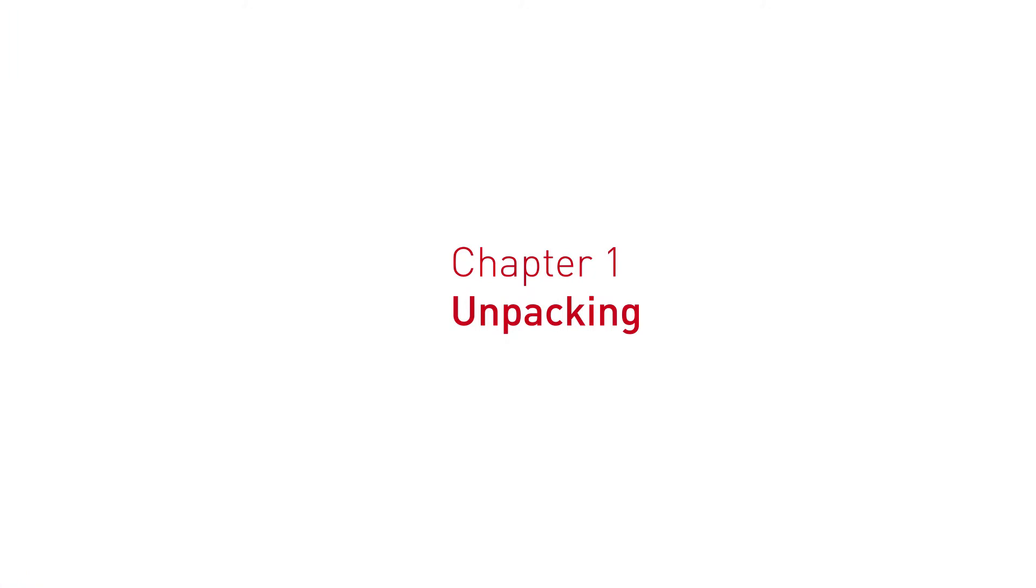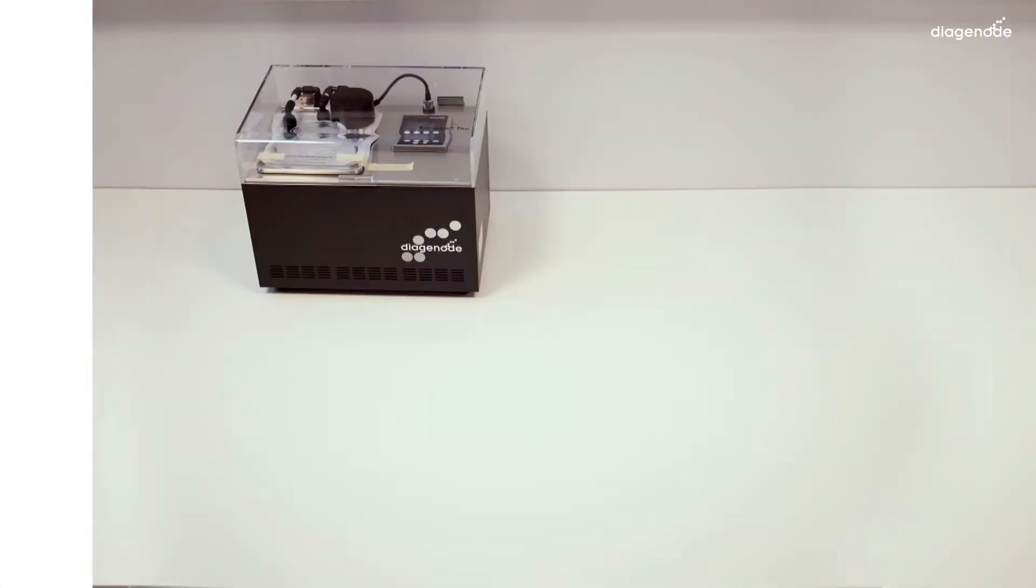We will start by opening your BioRuptor Pico box. You'll find the BioRuptor itself. Oh my lord, isn't it beautiful?